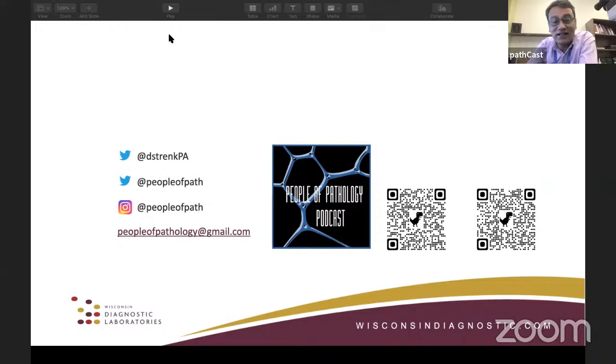And suppose, as Mr. Strenk has mentioned, there is a big lymph node, which is bigger, but you want to submit it entirely, then also you should mention it in your description, that cassette A1 to 1 lymph node serially sectioned. Otherwise, this will really give a wrong description, or wrong assessment when the pathologist sees it.